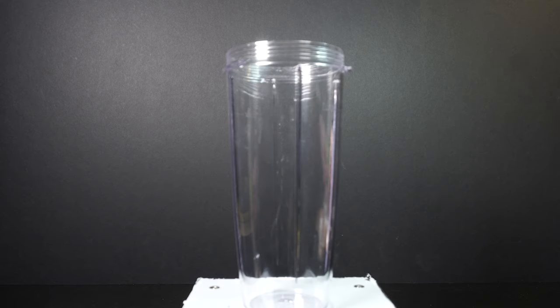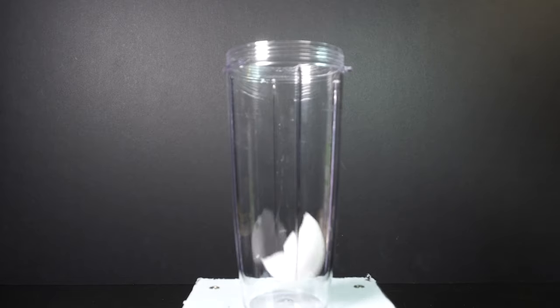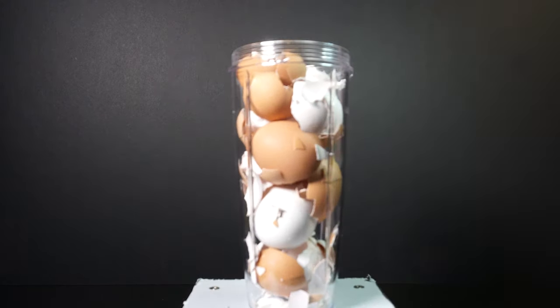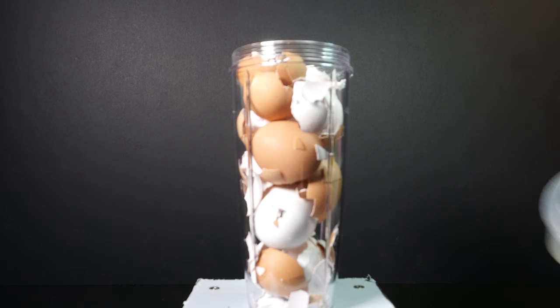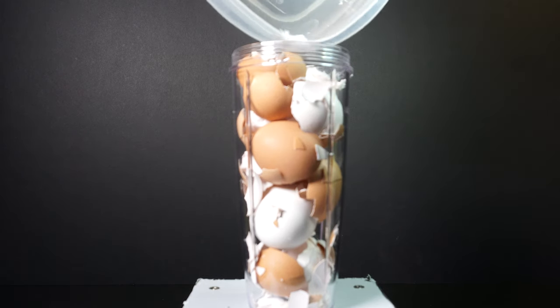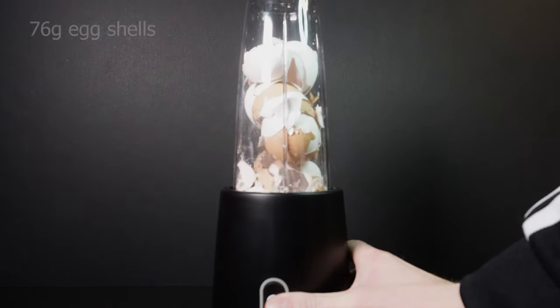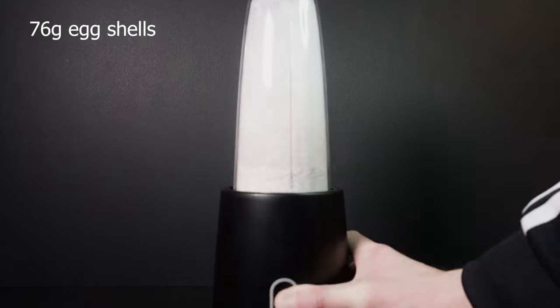The first thing we need to do is grind up all of the dry eggshells in a blender. I pre-cleaned my eggshells in water and waited for them to dry. This will help the other proteins from the yolk to be washed off. Otherwise I would have more to filter off later. The total weight of the eggs was 76 grams dry.